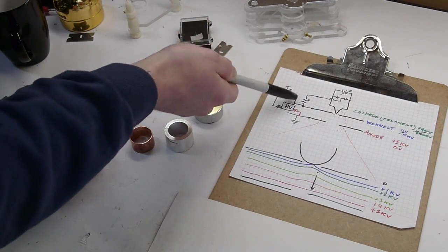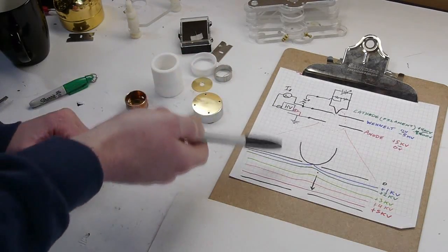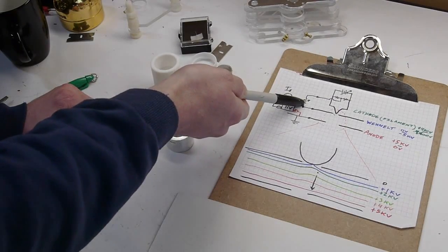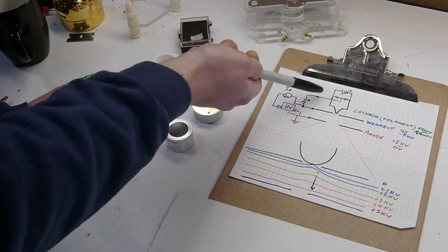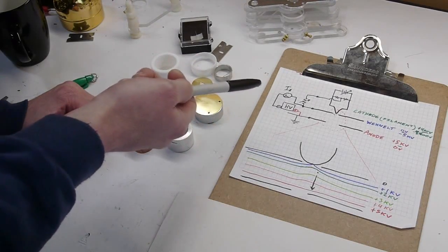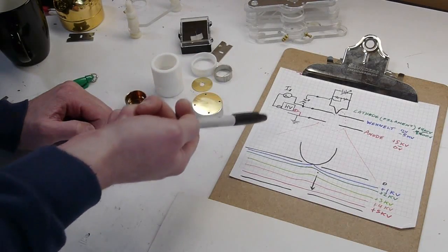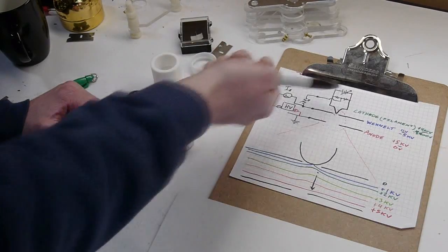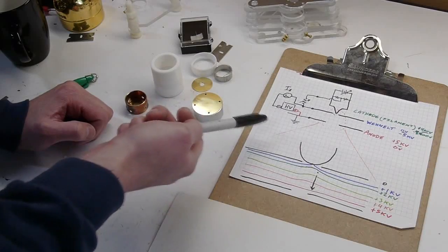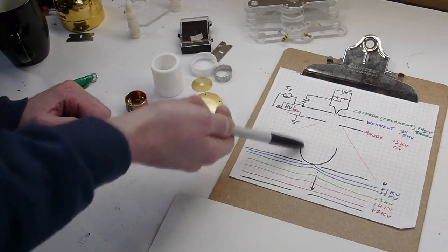So let's say the resistor is a huge value. In fact, let's just say it's open, infinite resistance. What's going to happen? The filament is going to get more and more positive as it boils off electrons and gets rid of its negative charge. It has no way of replenishing the charge because it's not connected to the rest of the circuit. This is infinite.